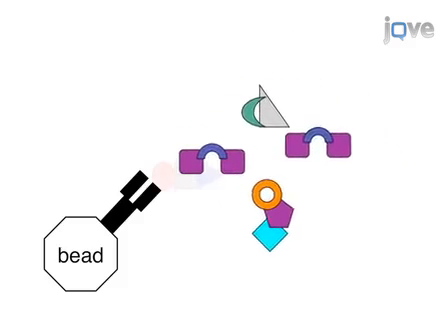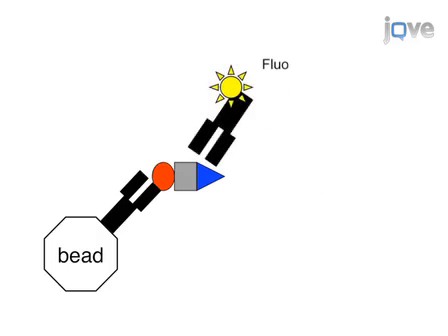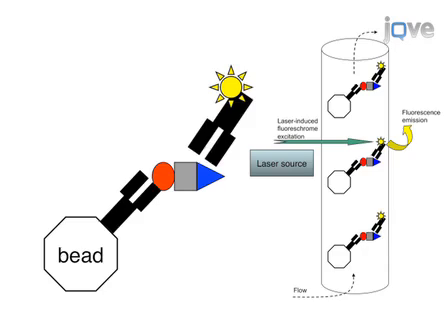to the beads. The beads, together with the captured proteins, are then washed and probed with fluorescently labeled antibodies specific for various molecules that may be associated with the immunoprecipitated protein. Finally, the fluorescently labeled beads are analyzed by flow cytometry to determine which proteins are present and which are absent from the captured complexes.